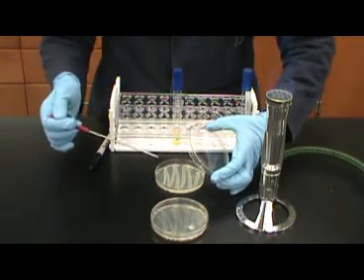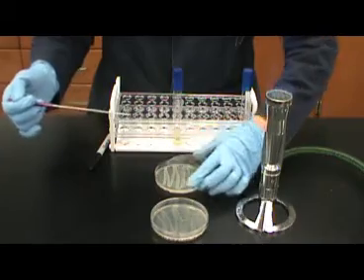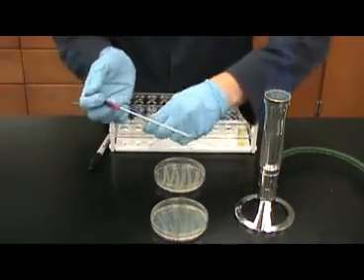Since gelatin is the solidifying agent used for the media and we are testing for the production of gelatinase, if gelatinase is produced, the gelatin can no longer allow the media to remain solid.